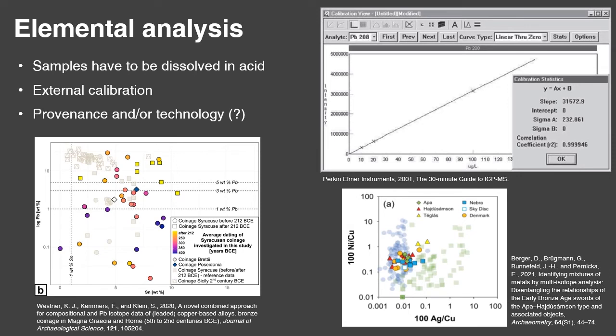Several elements determined in archaeological objects have an ambiguous character. Lead in bronzes can have been derived from the ore source, but it can also have been deliberately added to the alloy to improve its mechanical characteristics or to reduce the amount of more valuable tin. In the example for lead and tin contents in antique bronze coins shown on the left, a threshold value to distinguish between a geological or anthropogenic origin cannot easily be defined and might be further blurred by mixing and recycling processes.